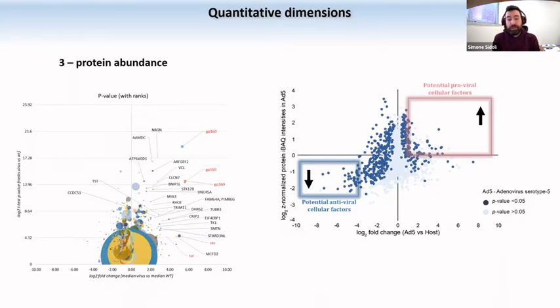For example, when you're looking for biomarkers, if you look at this figure here on the right, it's important to find a protein that is very specific for your sample, but it also helps a lot to find a protein that is not only specific, but is also highly expressed. And that's for multiple reasons, not the least the possibility of producing an assay to hunt for this protein that doesn't require a lot of sensitivity.